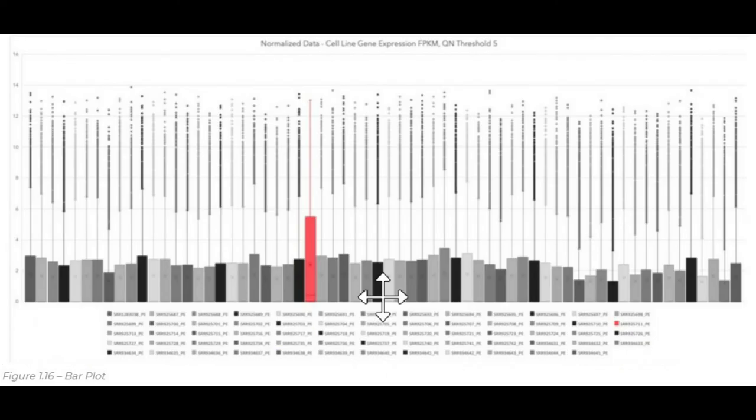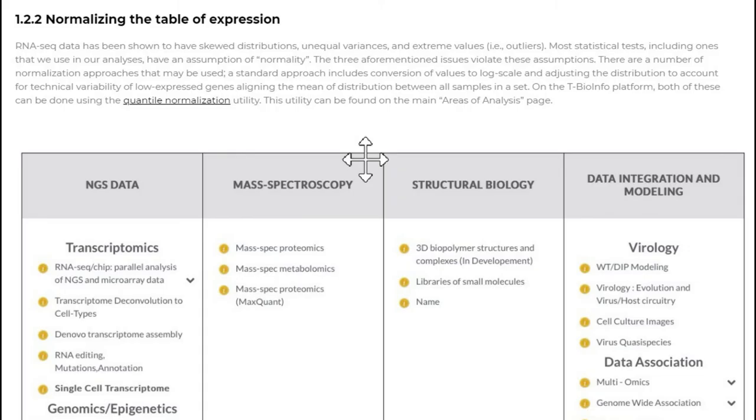To learn more about normalization, you can visit lesson number 12 under transcriptomics on learn.omicslogic.com portal.